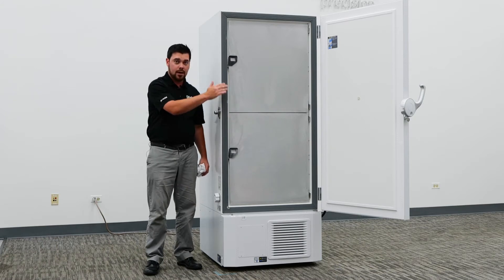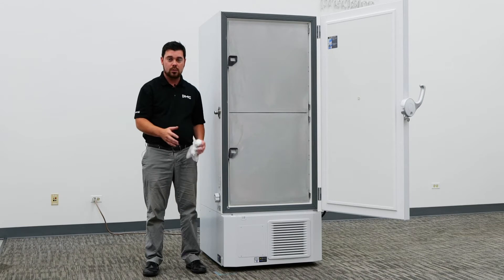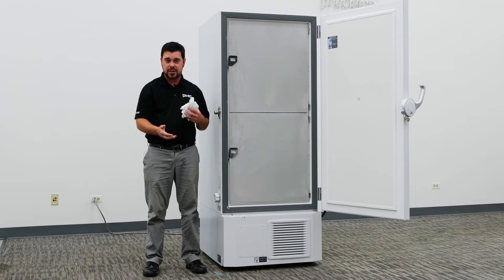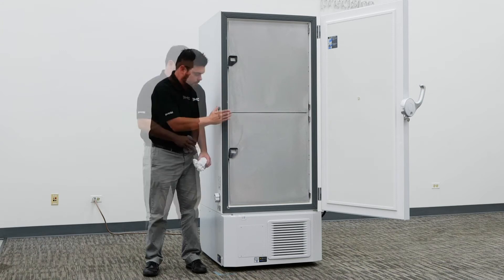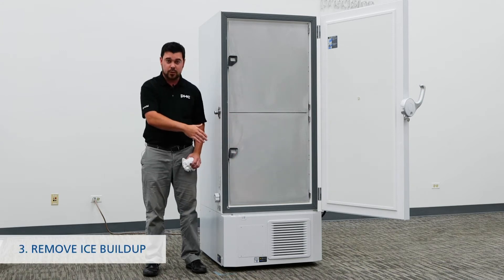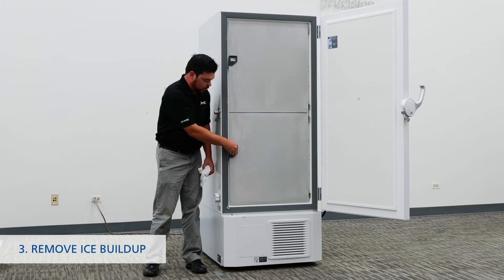As you can see in this freezer, we have uniform frost buildup, which proves that we have an adequate seal. With any minus 80 freezer you will experience some ice buildup — that is a normal occurrence with any ultra low temperature freezer. When you do start to see excessive ice buildup, it is important to scrape any excessive ice and ensure that all your latches and seals are good.